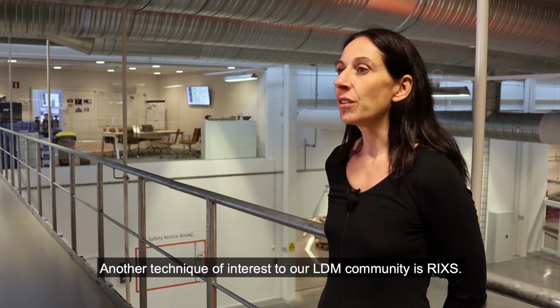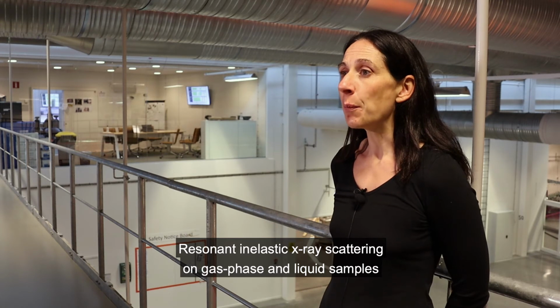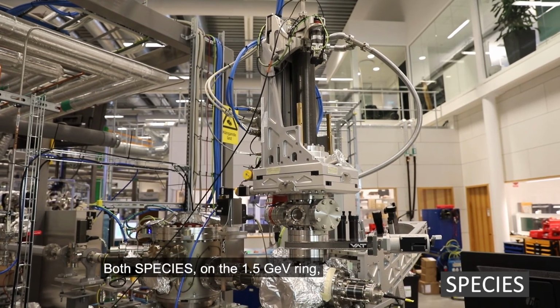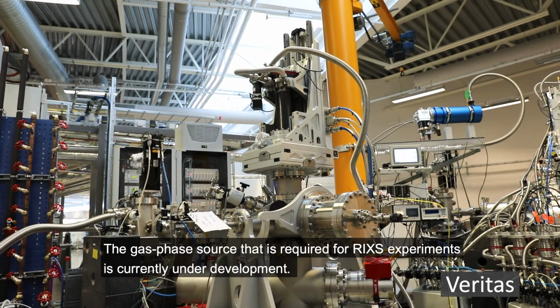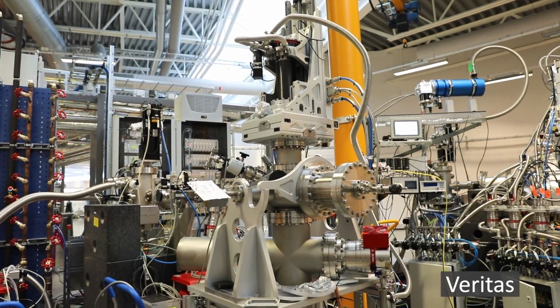Another technique of interest to our LDM community is RIXS. Resonant inelastic X-ray scattering on gas phase and liquid samples will be available to our LDM users within the coming years. Both SPECIES on the 1.5 GeV ring and Veritas on the 3 GeV ring offer access to RIXS techniques. The gas phase source that is required for RIXS experiments is currently under development.